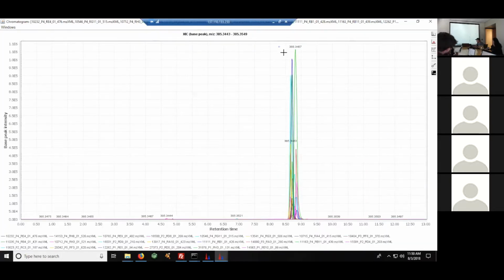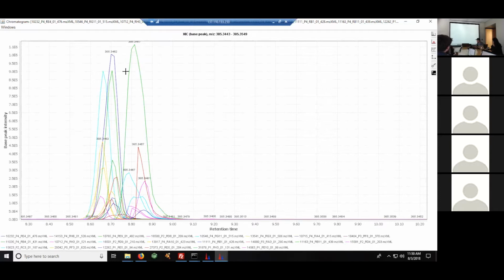Yeah. So that would be an aligned peak. Yes. So here, because we set it to 0.2 after Julia's question, this has been captured. Otherwise, this probably would have been split into two different features.